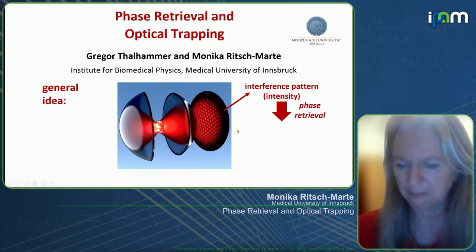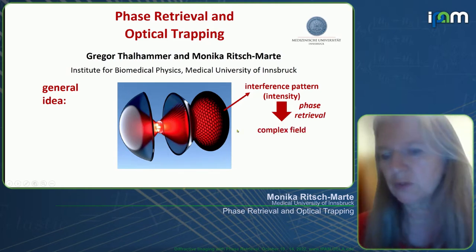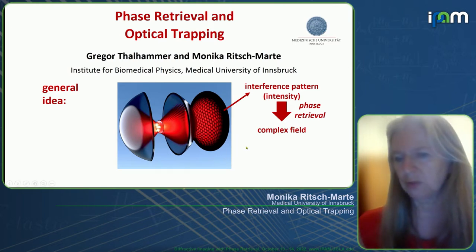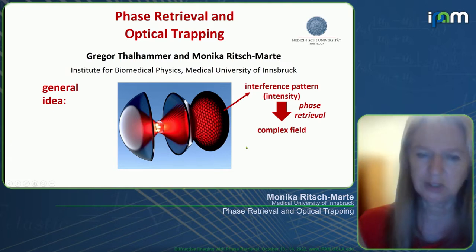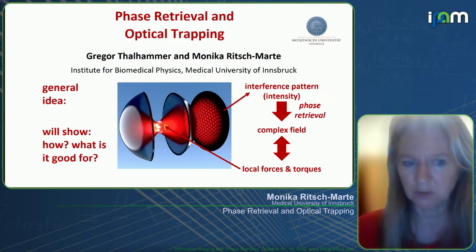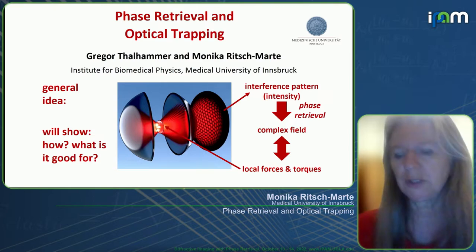in the object plane. And from this, we can then use the Maxwell stress tensor to calculate local forces on individual particles and also local torques on individual particles. So that's the general idea. And I will show you in my talk how we do that and what it is good for.